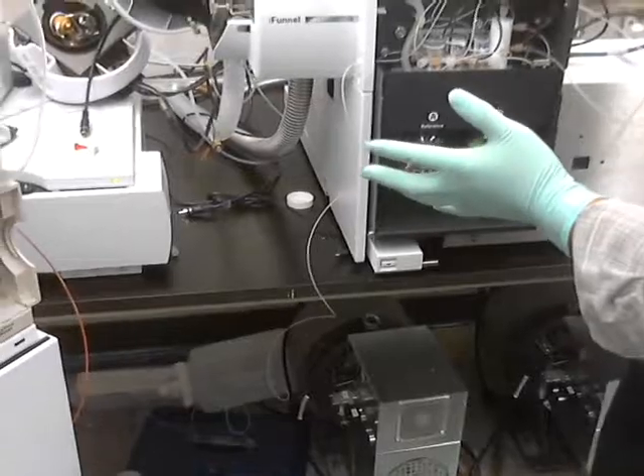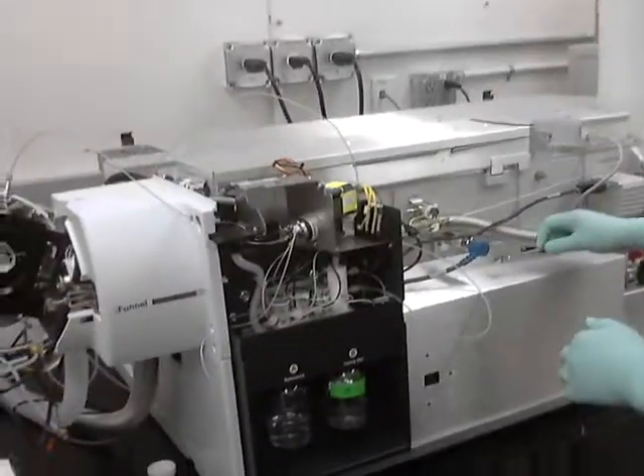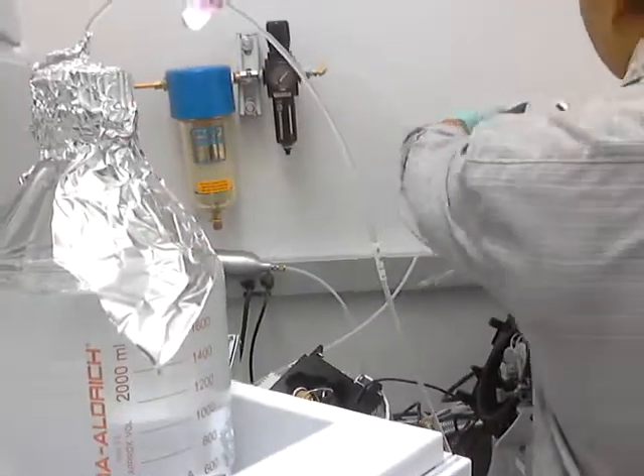So now I'm just going to take this part: put the covers off first, put the vent valve — set it off of course. And now just take the source off, and the cover, and then the ion funnel. So this source comes off.